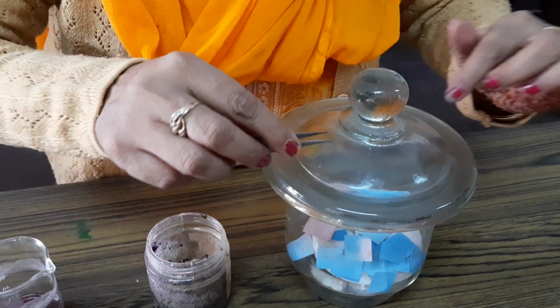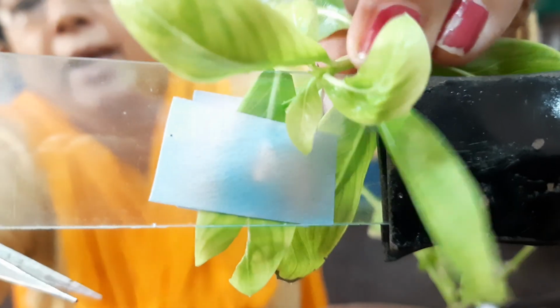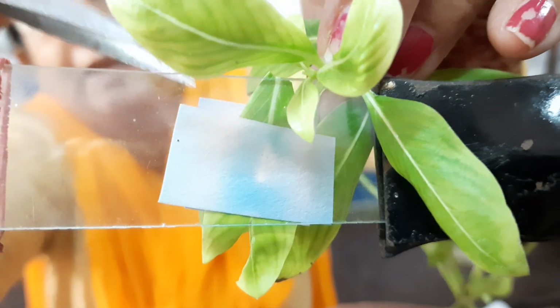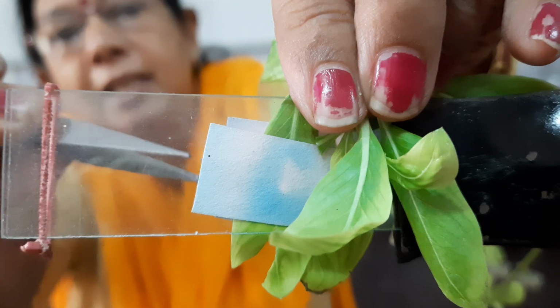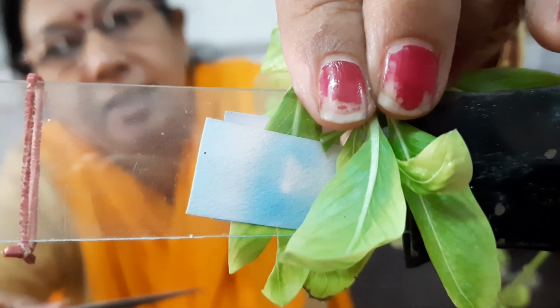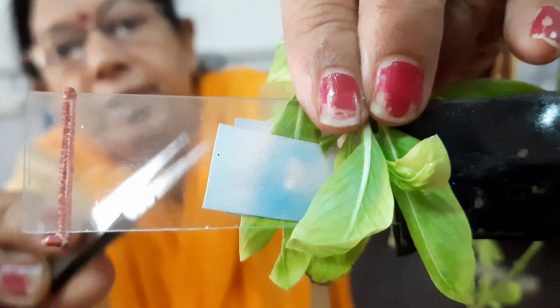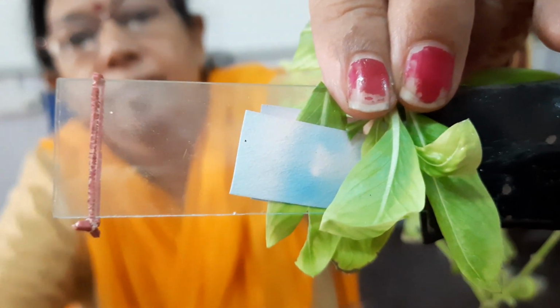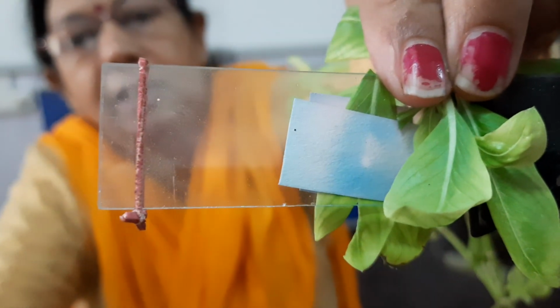Okay. Now I'll take two pieces of the blue paper and bring one to the surface of a dicot leaf. On the upper and lower surface I'll place one piece and I'll cover it with a glass slide on both the surfaces. The purpose of taking the glass slide is so that you can see the change in the color, and moreover it does not allow the water from the atmosphere to reach the cobalt chloride paper. Previously the paper which was taken was blue on both the sides. Blue paper was taken, dry paper.